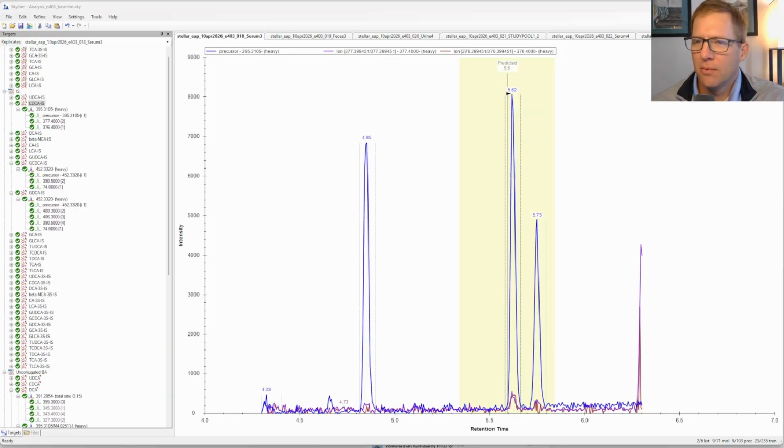And today we're going to do 4 quick tips for curating data in Skyline quickly. Skyline has a lot of really good visualization tools that help you to quickly see whether or not the data is of high quality and to look for areas where there may need to be a reintegration, for instance, of a peak. So this morning I'll share 4 tips that I like to use in order to quickly see if there are issues with your raw data in Skyline. So we'll just jump right into it.